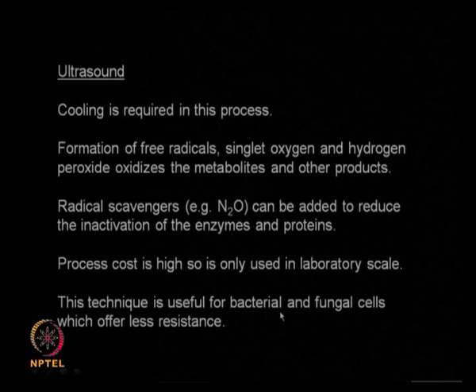It is also good for bacterial and fungal cells, which offer less resistance. It cannot be used for plant cells which are very tough, so it is ideal for these types of cells only.